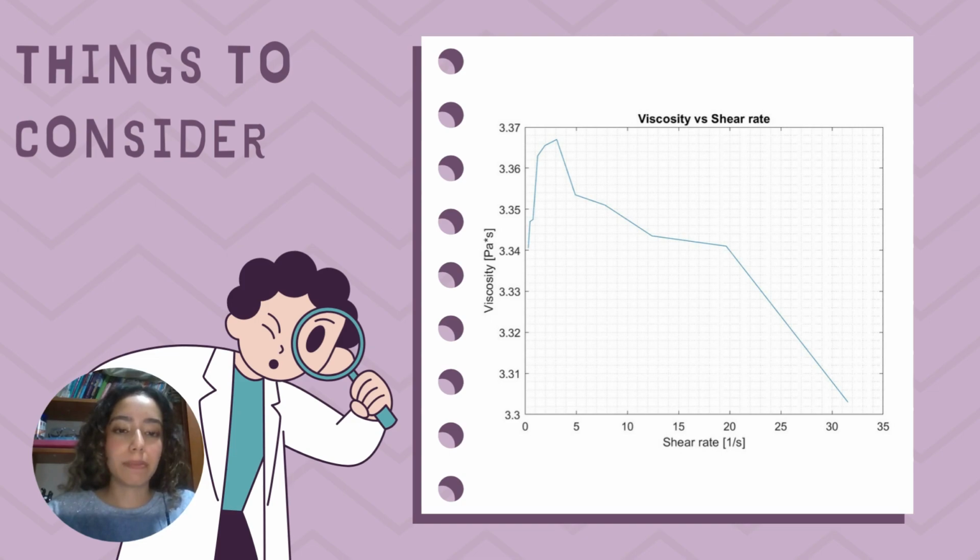A rheometer is a precision instrument that contains the material of interest in a geometric configuration, controls the environment around it, and applies and measures a wide range of stress, strain, and strain rate. If the fluid is Newtonian, a normal force cannot be generated.